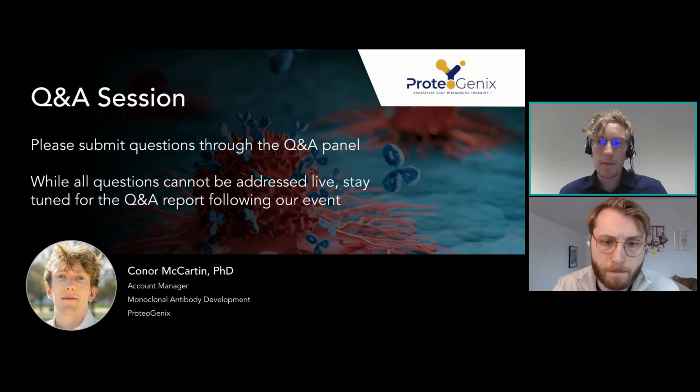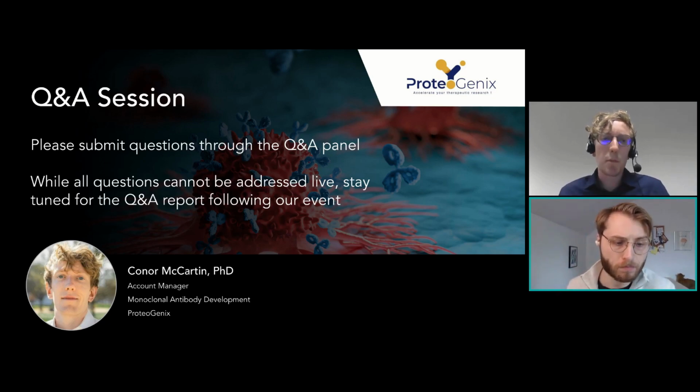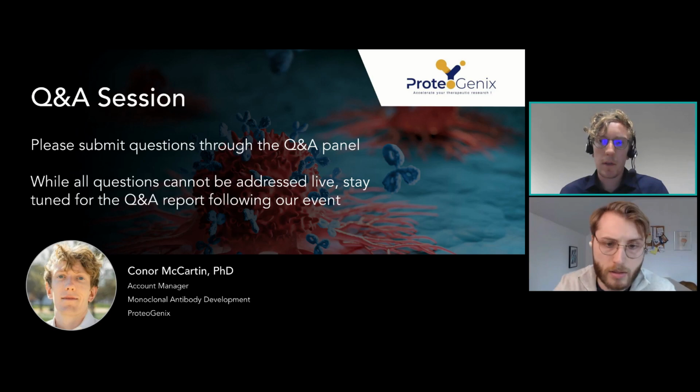Fantastic. A few questions about antigen here. So how much antigen would I need to provide? About 1 milligram is more than sufficient for a phage display campaign. Excellent. And what types of antigens can be provided as well? It's almost anything, I would say.